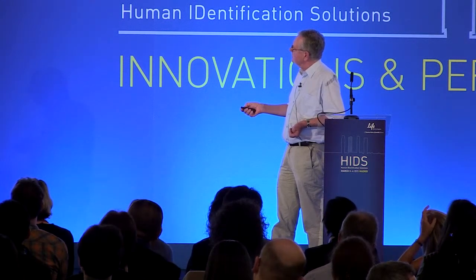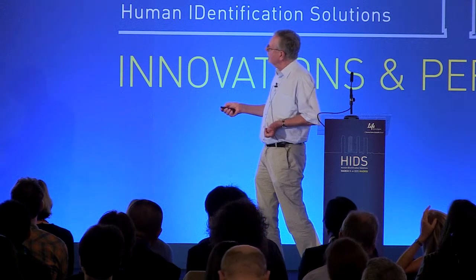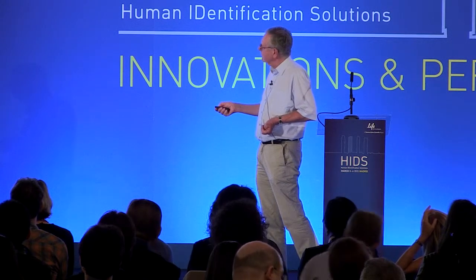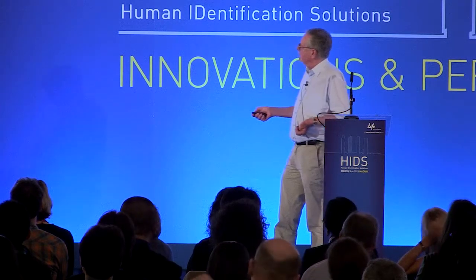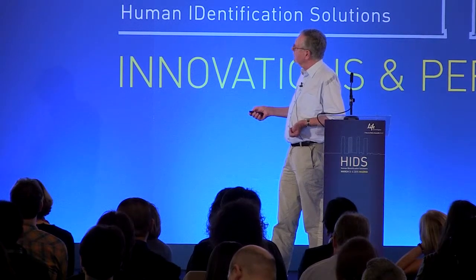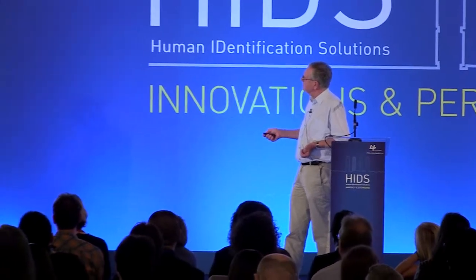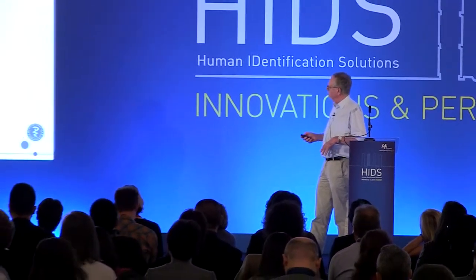This is 10 picograms. And when you reach these 2 nanograms here, then it will work. And with 500 picograms, it will work reasonably well, but there are some difficulties, of course.